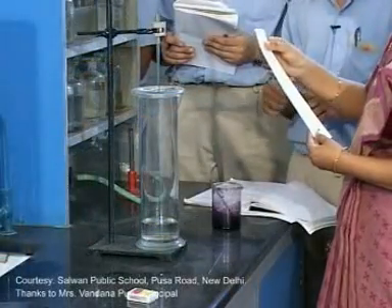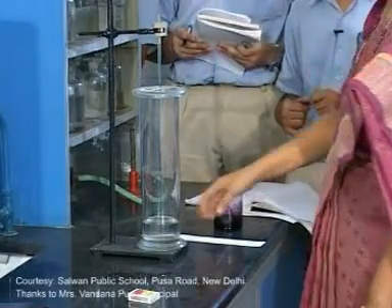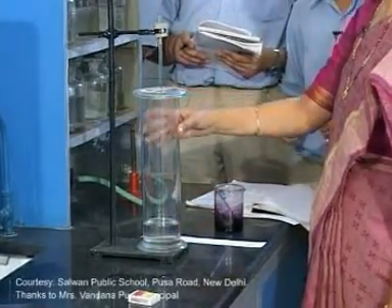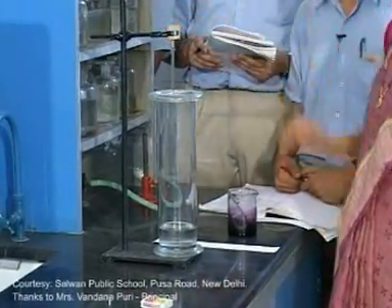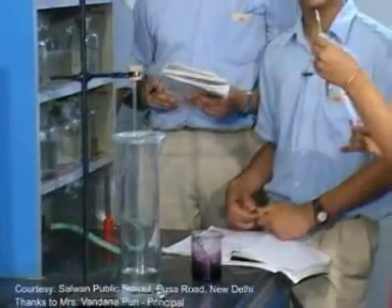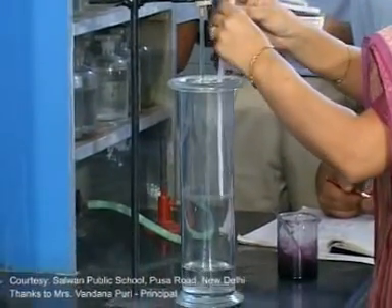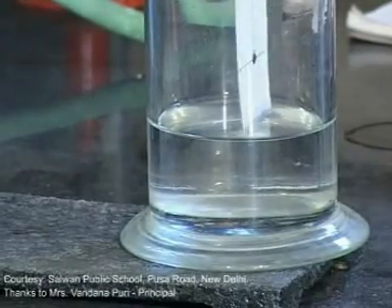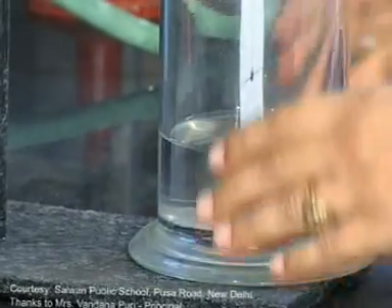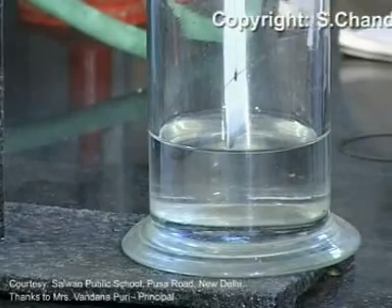The spotting is over. Next, move to the next point: the setting of the apparatus. This is a gas jar, iron stand, and hook. Suspend this filter paper strip into a gas jar containing water with the help of a hook. Make sure that the spot does not dip in the water.